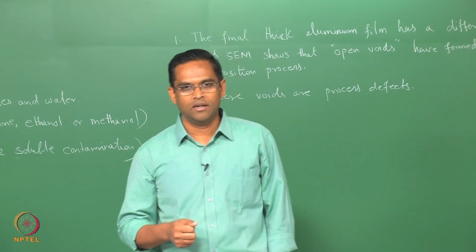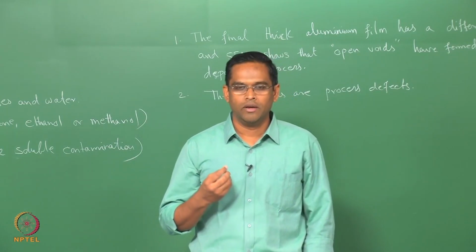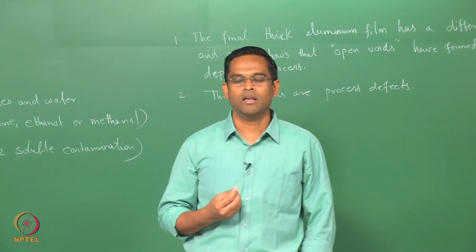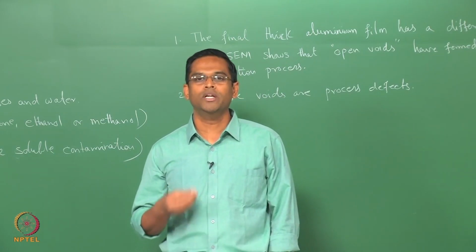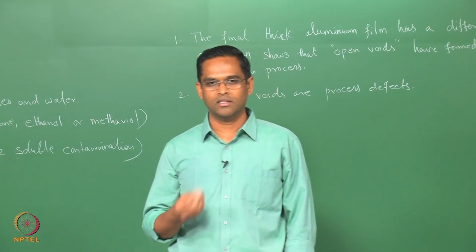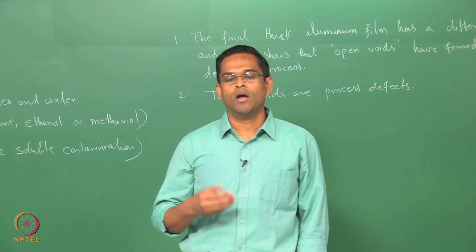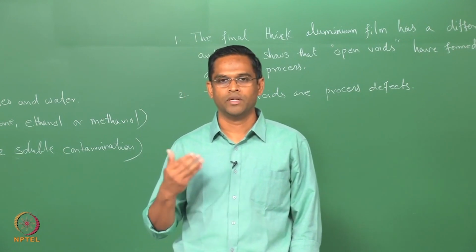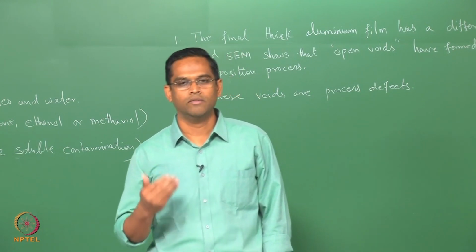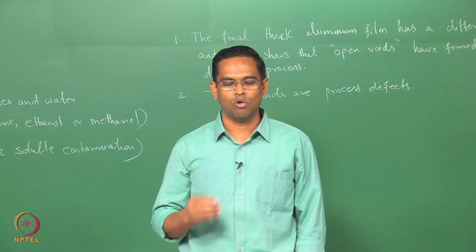And if you want to find out the traces of elements, or the elements which are present in very small quantities, you need to adopt another technique called WDS, or you have to go to special techniques like TEM with an attachment for electron energy loss spectroscopy and so on.